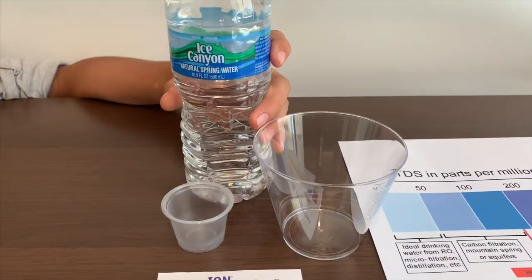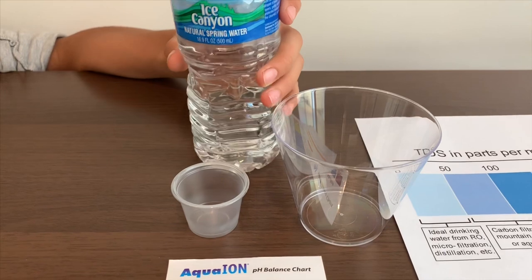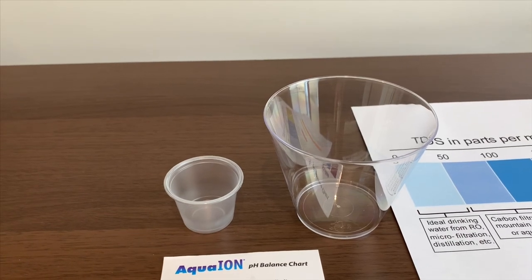This is Ice Canyon Natural Spring Water from California. We bought it at CVS for $1.00. Let's pour some in so we can test the TDS level and the pH level.